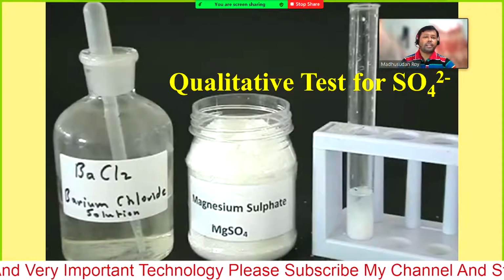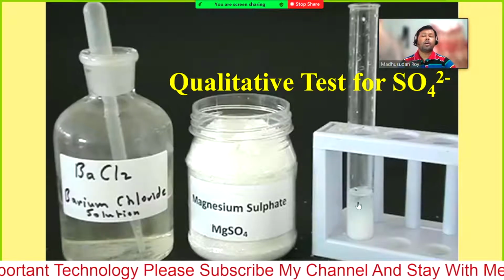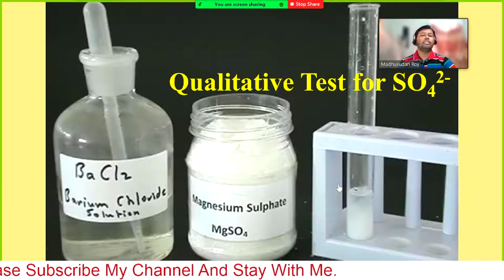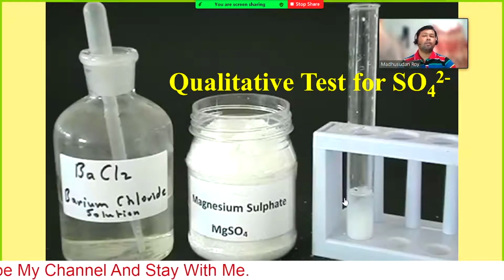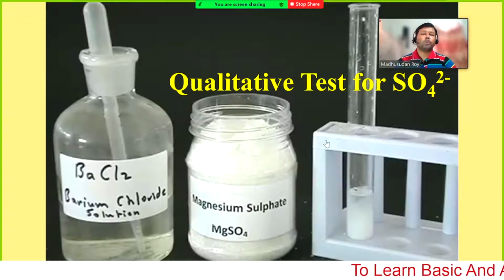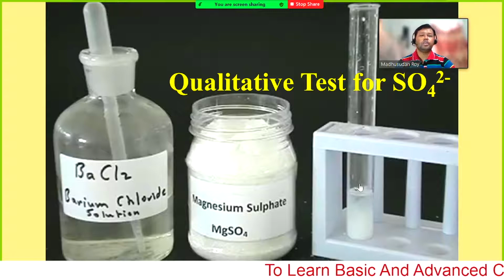After addition of a single drop, here only 2 drops have been added. So 2 drops of barium chloride is enough, or 1 drop is also enough. If you have the white precipitation, you can confirm the presence of sulfate in your sample.